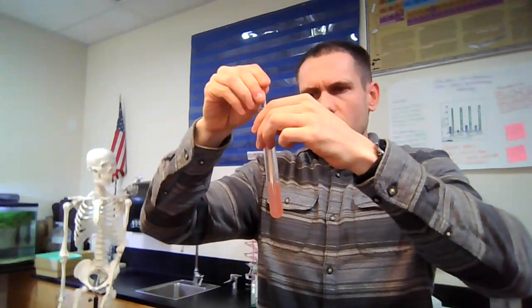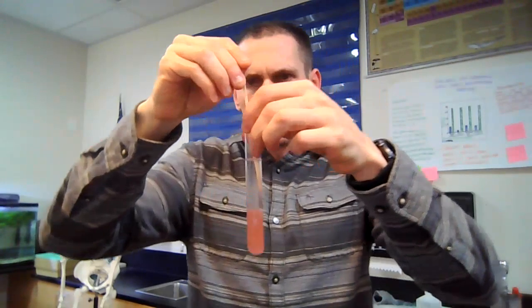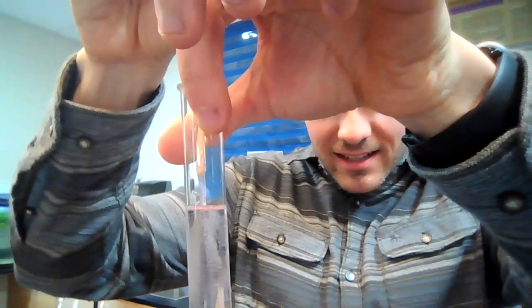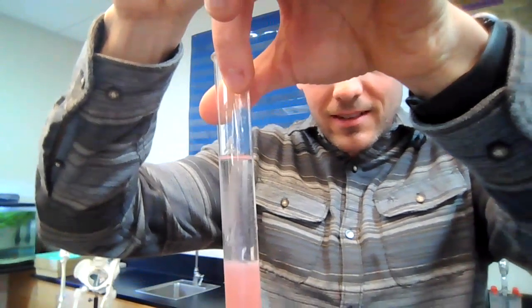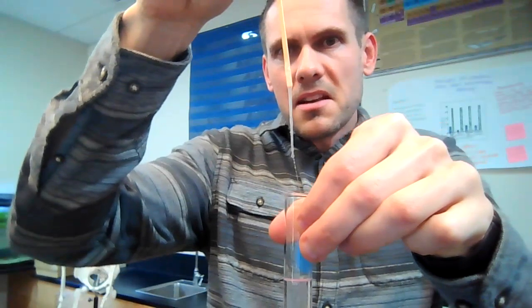So you can twirl it around a little bit. Take turns pulling up the stick very gently and look for that little clear substance. See right there? It looks like snot. That's nasty. What? That's cool. See if I can pull it out all the way. Oh, look at that. Oh, nasty. So gross. That's pure DNA, my friends. That is 100% pure strawberry DNA.